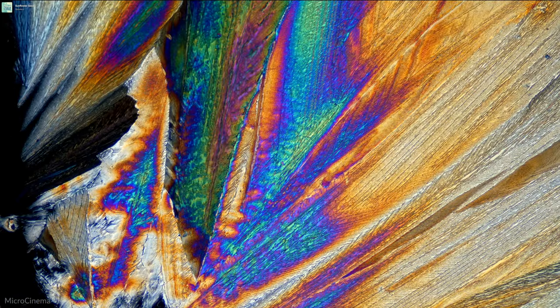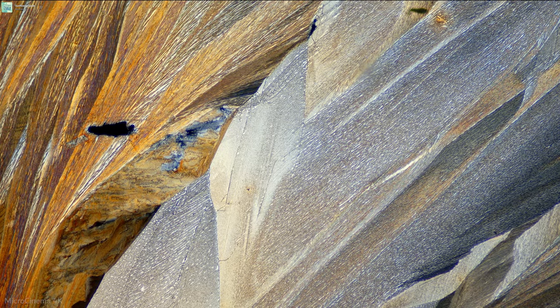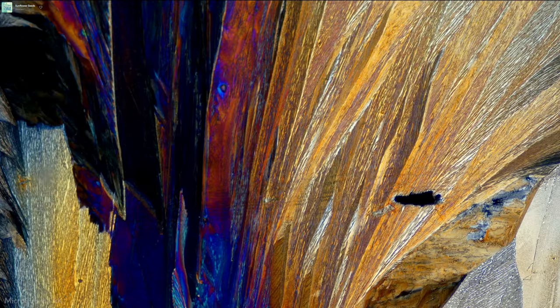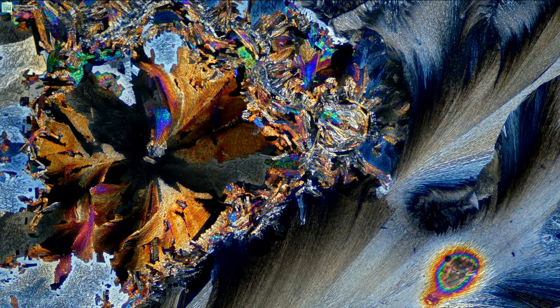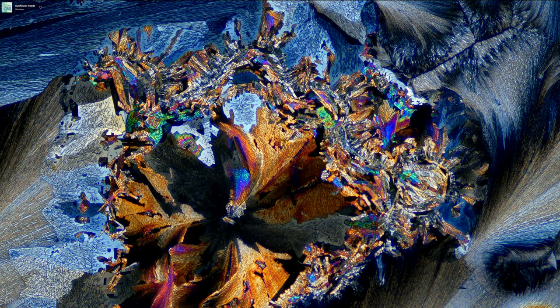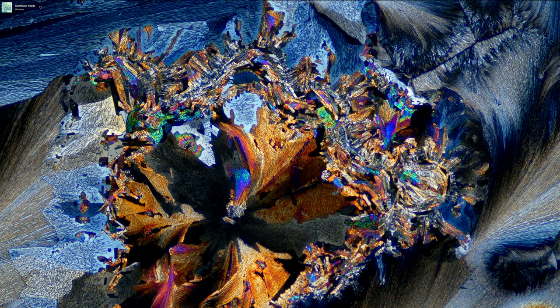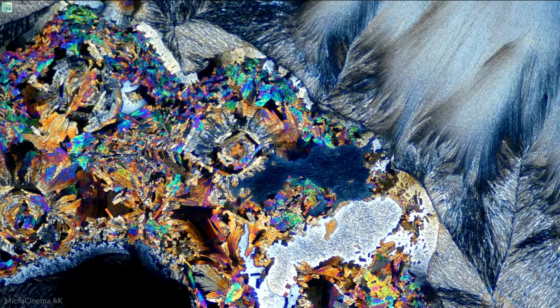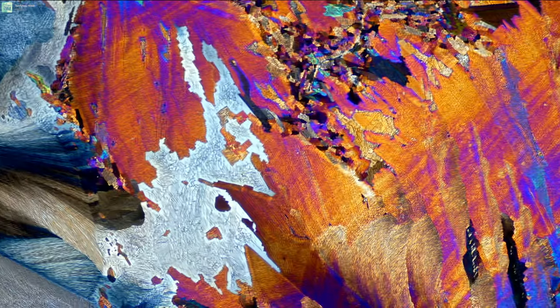Yeah, these crystals twist the orientation of the light's polarization, but they do so in a wavelength-dependent way. And so sometimes, like this bright spot in the middle, all the wavelengths are getting turned, and it just kind of passes through more or less normally. And then for these really colorful areas, certain wavelengths are getting cut out while the rest come through, and so that gives us different hues. You can spend ages on slides like this.